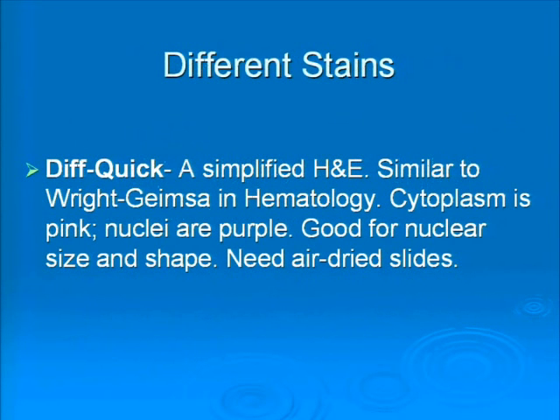So the Diff-Quik stain, while we can use it in clinic, the other benefit of it is that it lets us see and appreciate colloid a whole lot better than a pap stain does. So in thyroid FNA, the really good thing about the Diff-Quik is that it allows you to look at something rapidly, while the patient's there with you, and you can determine adequacy, and it gives you a better appreciation of colloid.